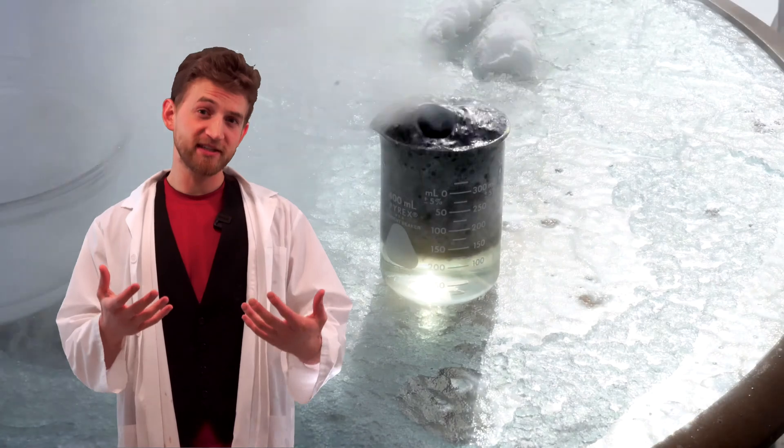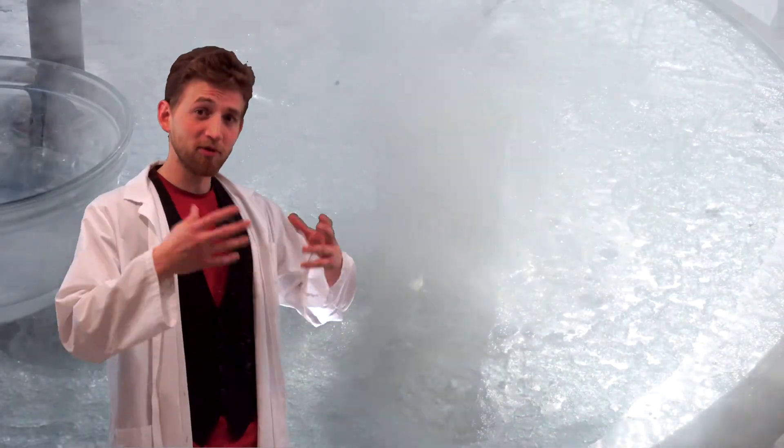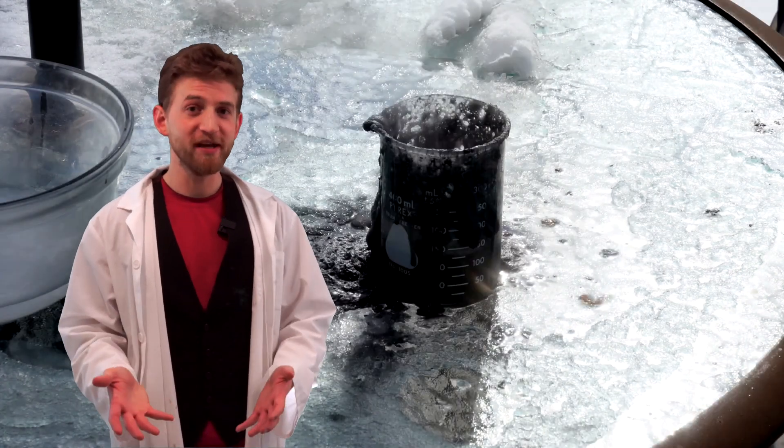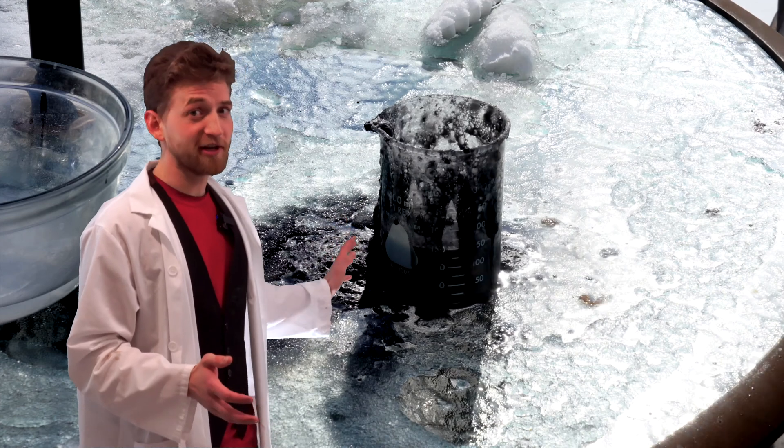Safety-wise, this isn't the best, because you should never really let solutions like this bubble over, because then you can't control where everything goes. But in this case it's for fun, and I'm going to clean everything up really well.